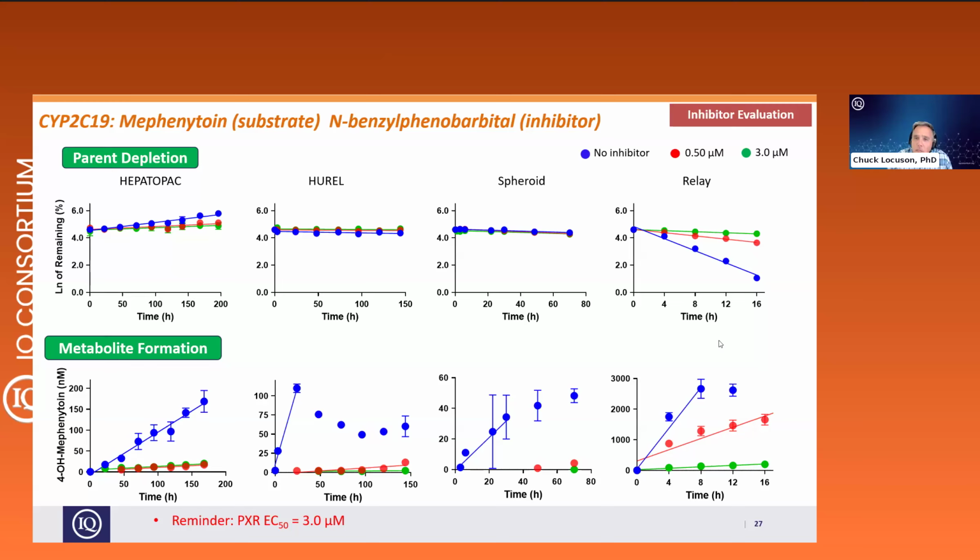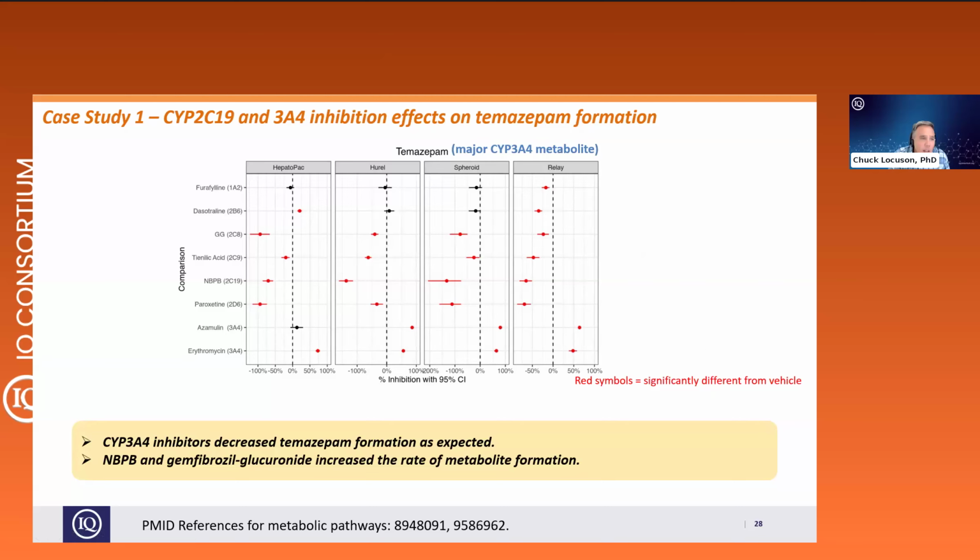All right, next slide to show you the metabolite formation data with temazepam. With diazepam, we're focusing on just temazepam because these studies generated a lot of data, and to make this more digestible, what we've done is plot the 3A4 metabolite formation to temazepam by the relative changes.